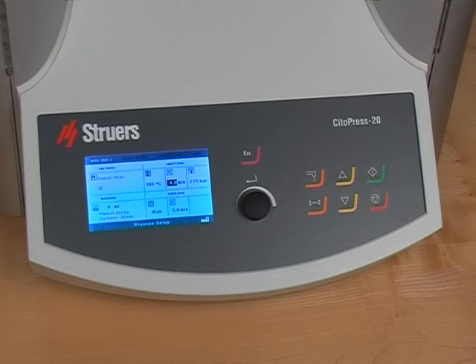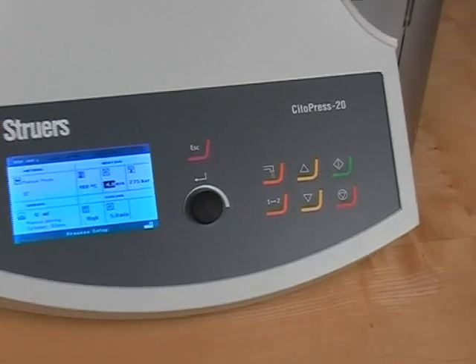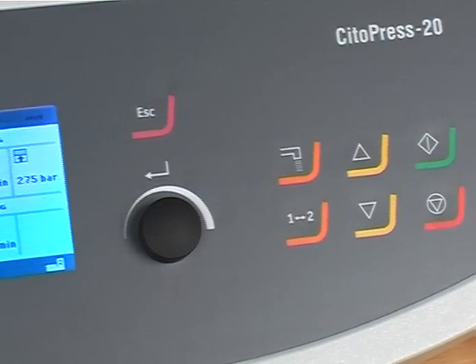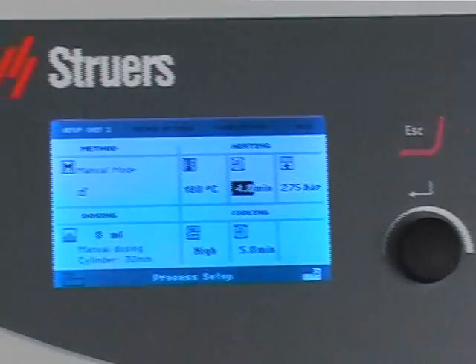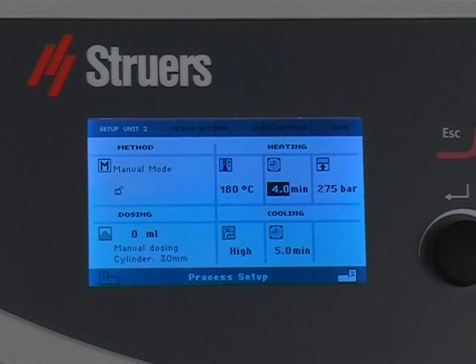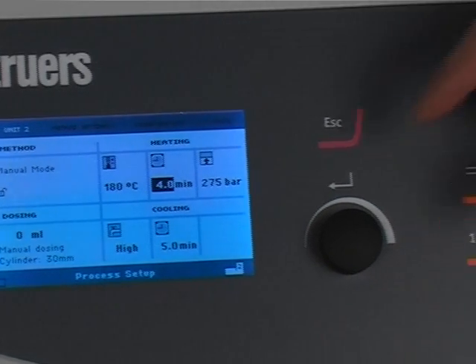Users have told us that the other important thing is ease of use. We have reduced the number of operation keys to the barest minimum. A large state-of-the-art display gives clear information on all relevant parameters in one single view. Our unique turn push knob allows the operator to change parameters in seconds.